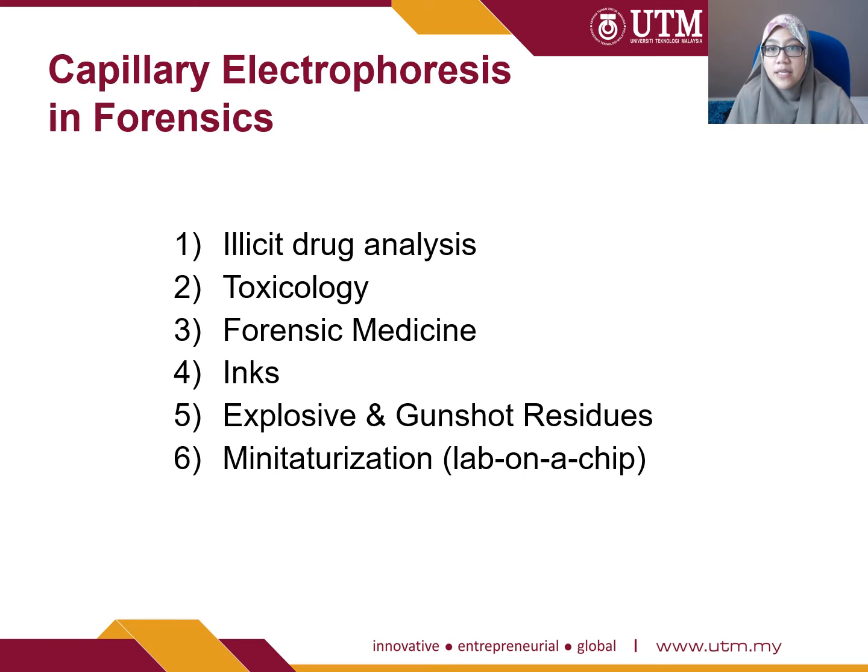And then the second part is toxicology. People use CE in toxicology usually for drugs, either illicit drugs again, and also therapeutic drugs, or not only therapeutic and illicit drugs themselves, but also their metabolites. They use CE in toxicology because toxicology can cover a wide range of biological matrices, for example, urine, blood, serum, and etc.